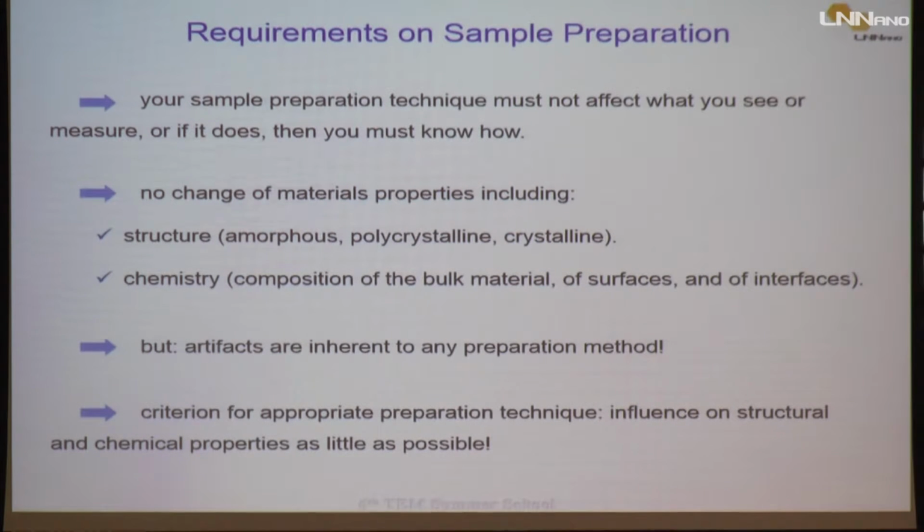In my case yesterday, I saw with XRD that the sample was crystalline.